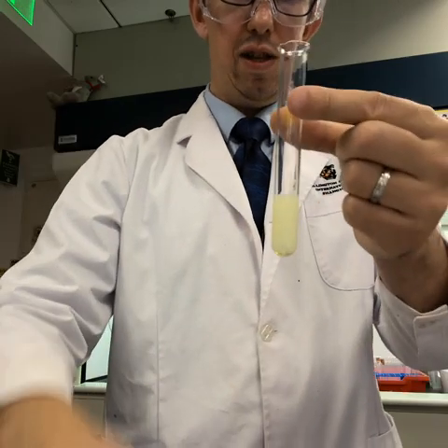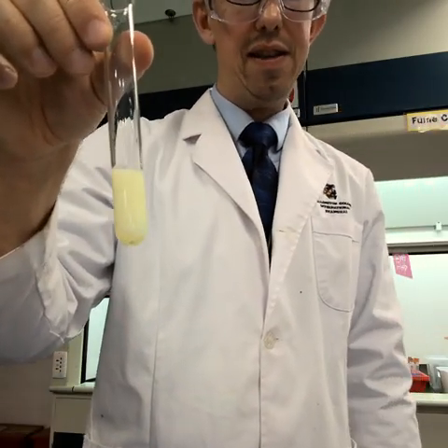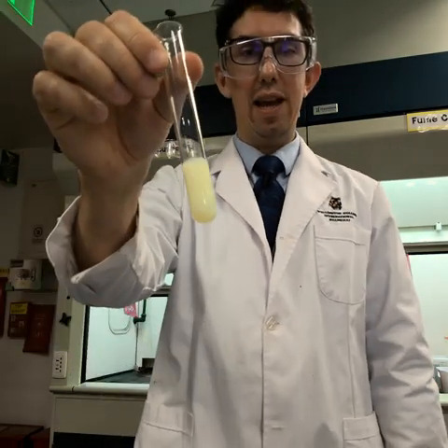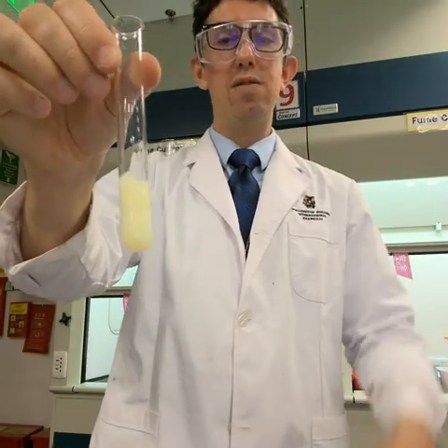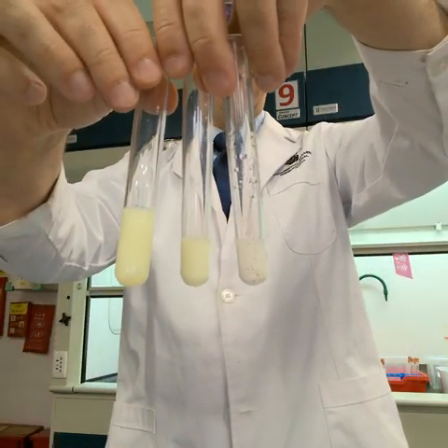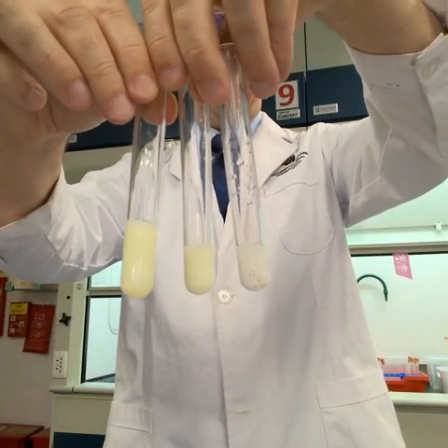Okay, and we can see this one's definitely not white. And this is described as a yellow precipitate. And if you get a yellow precipitate, it shows that there is iodide ions, and this yellow precipitate is caused by silver iodide. So here they all are together. We can see white, cream, and yellow.